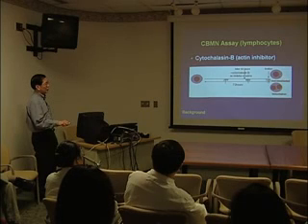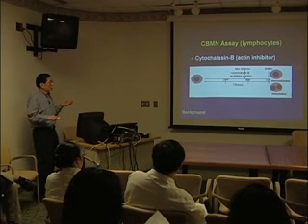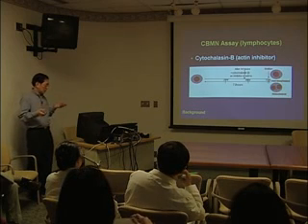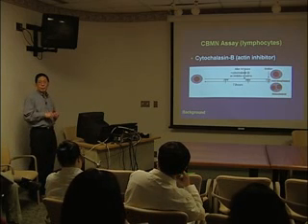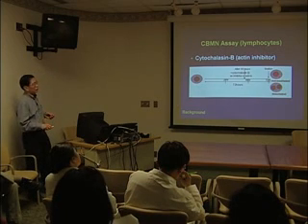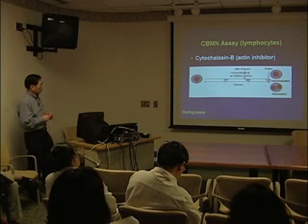And there, if you have a micronucleus, you can see a small dot of nuclear material stained by, say, Giemsa stain. The reason you have this is that it could be some inherited micronuclei formation or background amount of micronuclei. So this could serve as a sort of background measurement of your population.